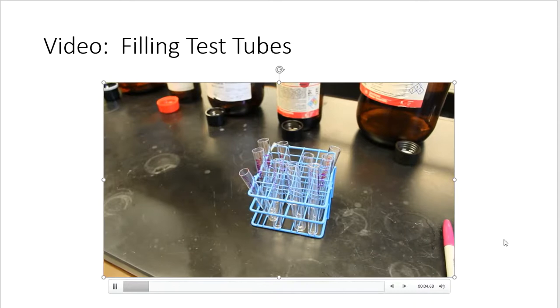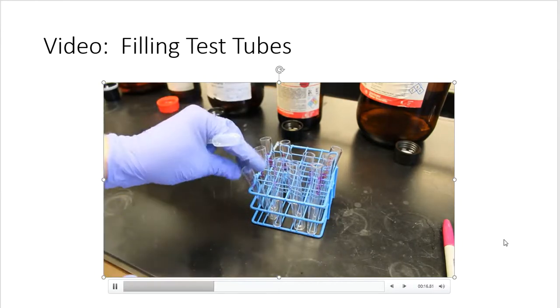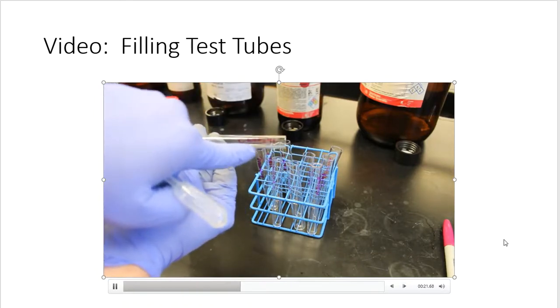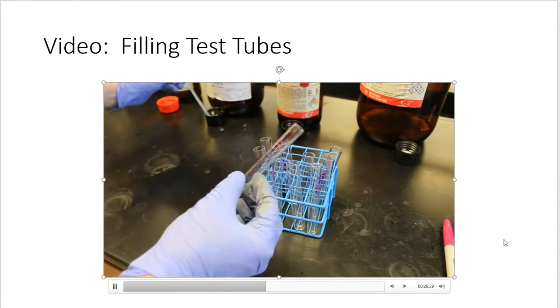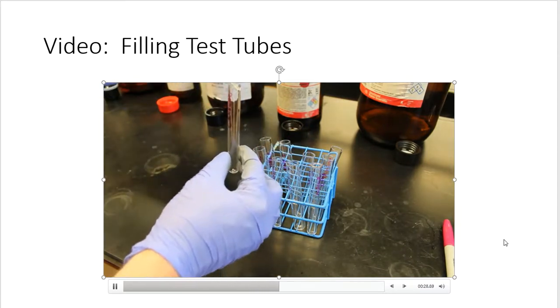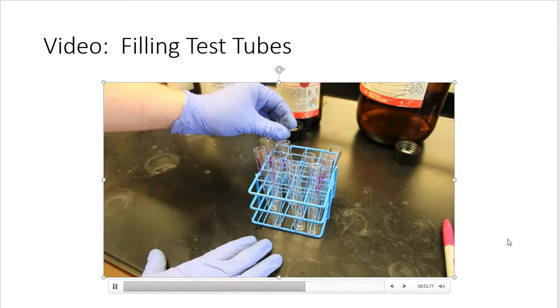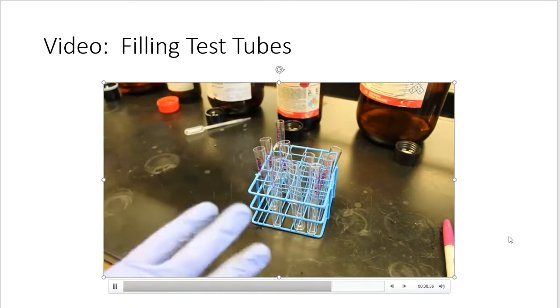Okay, so I'm doing the first part of the qualitative experiment, and this is focused on the PBP. So the 2% PBP is going to be added to each one of these unknowns. And what I have here is a test tube rack, of course, and in the test tube rack, I've got these labeled. So for instance, this says cyclohexane, and I'm going to add a couple of drops of cyclohexane. It says 2 drops, so into the test tube it goes, 1, 2. It doesn't have to be exact. There we go. And I'm just going to set this aside. So I'm going to continue to do this for all of them and have them all ready to go.